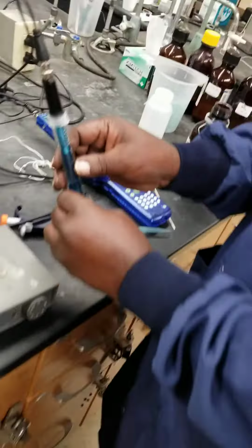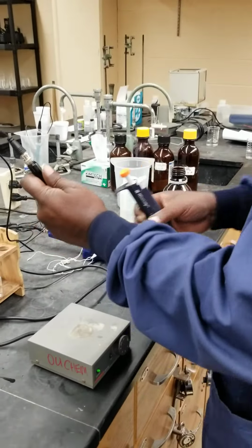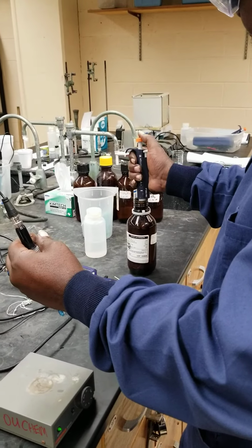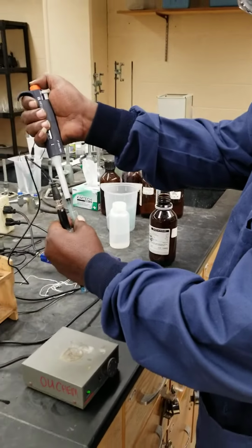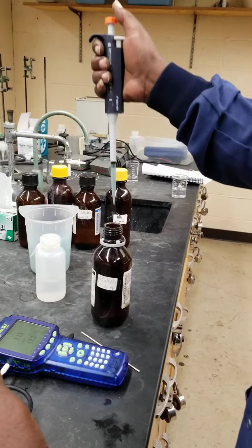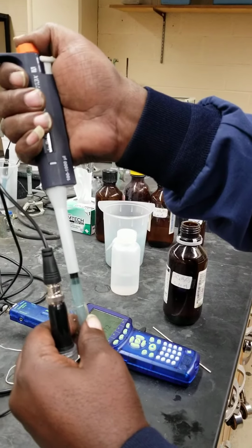We are now going to add an additional 3 milliliters of sodium acetate. One. Two. Three.